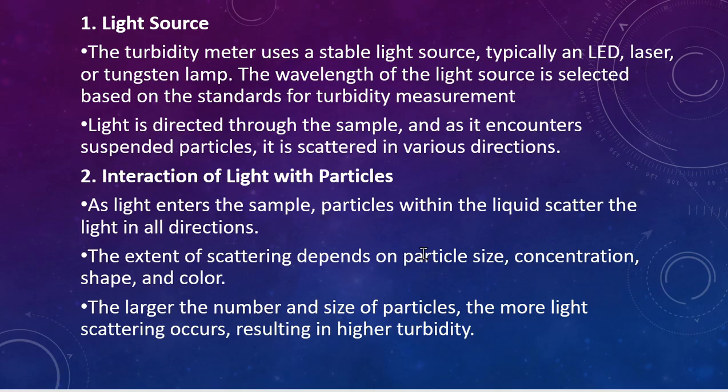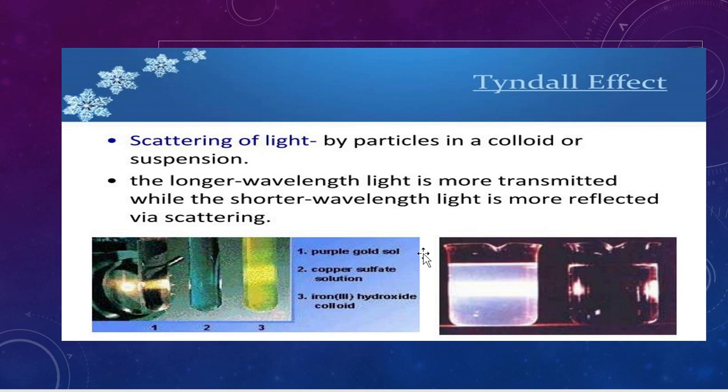The extent of scattering depends upon the particle size, concentration, shape, and color. The larger the number and the size of the particles, the more scattering occurs, resulting in higher turbidity. The scattering of light occurs by an effect called the Tyndall effect. The longer the wavelength, the more the light is transmitted, while shorter wavelengths are more scattered.